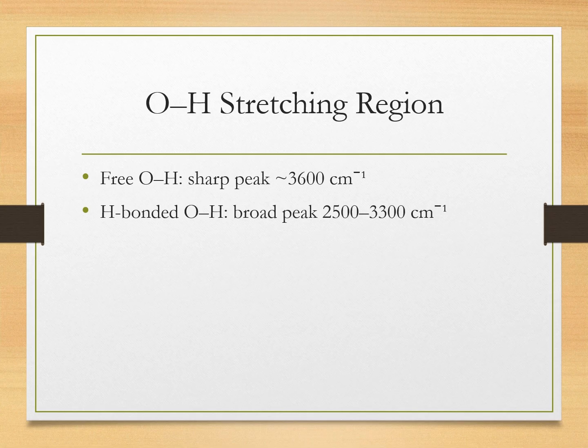And now we will discuss the hydroxyl or OH bond stretching region. For alcohols, phenols and water, hydrogen bonding dramatically changes the OH stretching region.